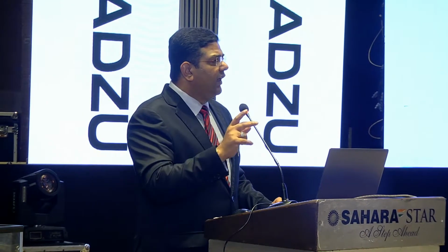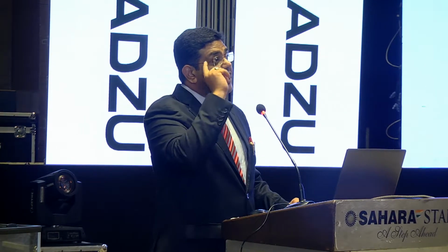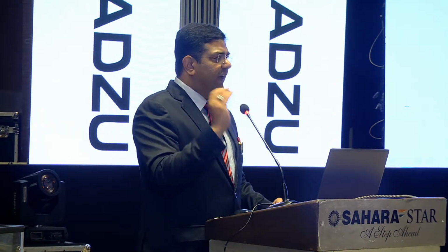You will see that, and in this, computer connectivity, CFR compliant, only 2 manufacturers in the world until now, and that too with their highest range. So you know Shimadzu quality, you have been selling this for a couple of years now. You know the quality, durability and performance. So we will stand guarantee to our quality. And with this feature, you can go and fight against any brand in the world. The moment you say CFR compliant and the customer wants to connect with a computer, you have the order on your table.